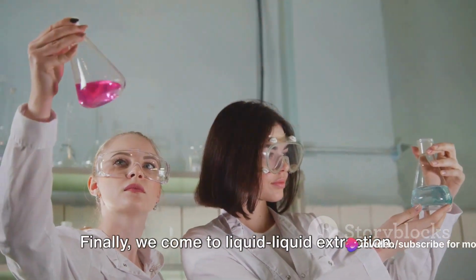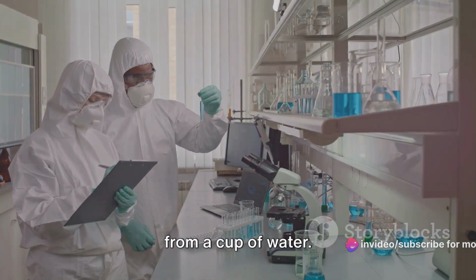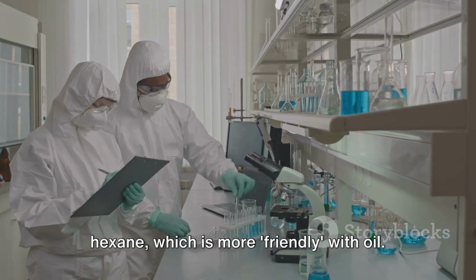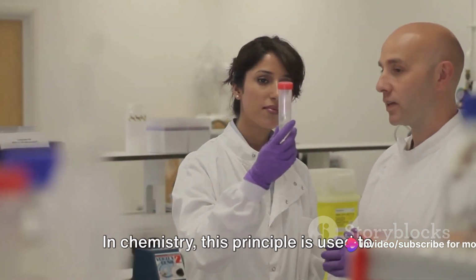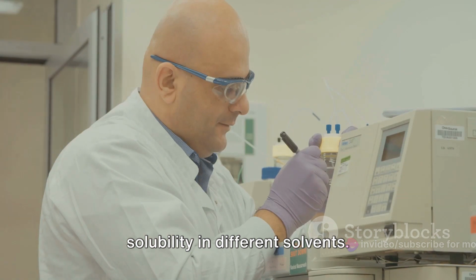Finally, we come to liquid-liquid extraction. Imagine trying to separate a drop of oil from a cup of water. You could add another liquid, say hexane, which is more friendly with oil. The oil would prefer to mingle with hexane, separating from the water. In chemistry, this principle is used to separate substances based on their solubility in different solvents.